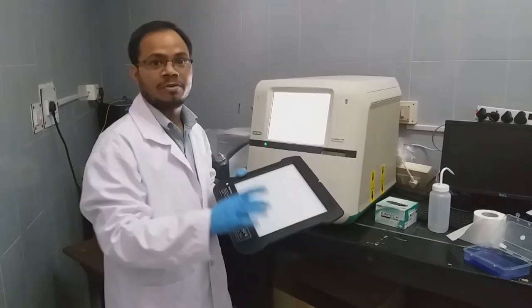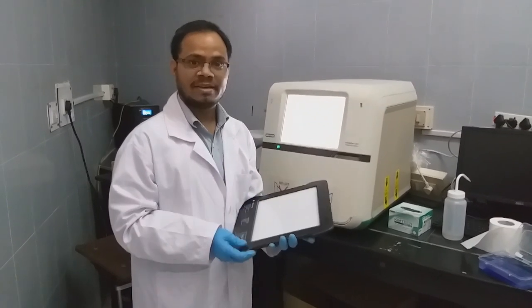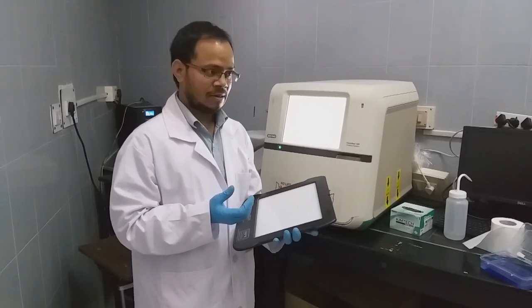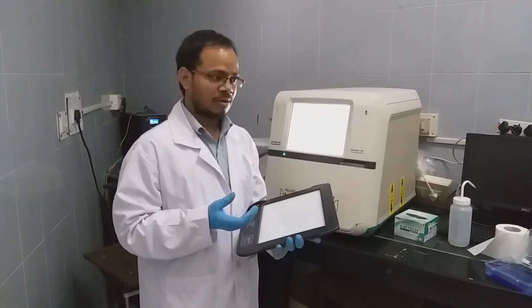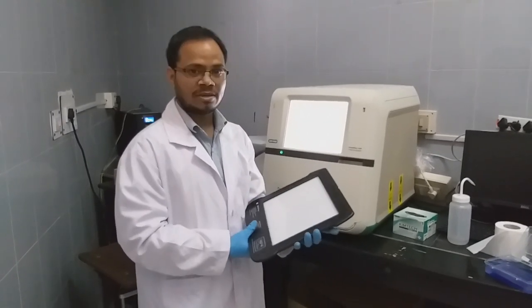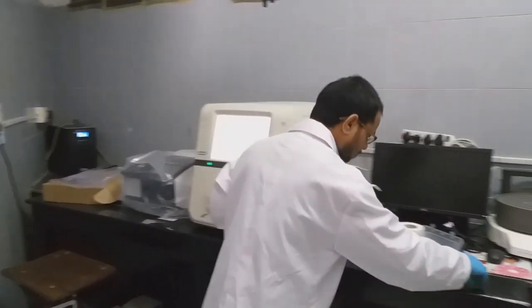Here we will use a white tray. There is another one, a gray or UV tray, also there. With that you can see any fluorescent one, or stained with ethidium bromide, or blots, chemiluminescent blots. But for normal protein imaging, we can use this white tray. So I'm going to keep the gel on this one.